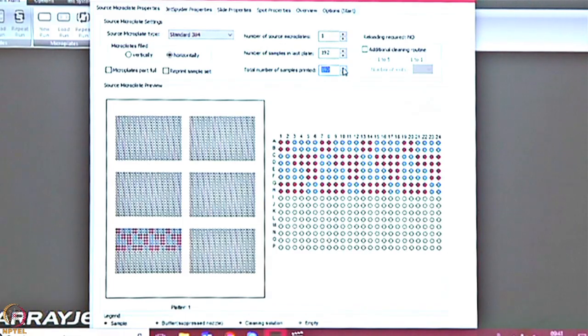So you can generate your plate map, you can generate your data sheet. You can generate these looking at how you want it to fill. So if your plate right now has certain samples in certain specific locations, then the software can also go and pick up that sample from that well. So it's so flexible.